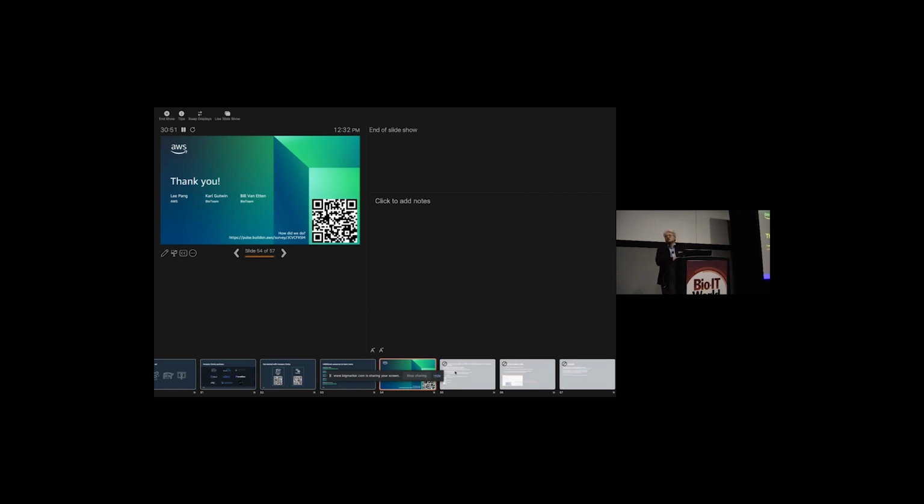If you have that cache sitting in S3 or other storage mechanisms, you can effectively call that and say that is an input to your workflow. Then once you get to that step of the workflow with VEP tooling, it'll use it. But there are potentially other use cases that we should probably dig into.